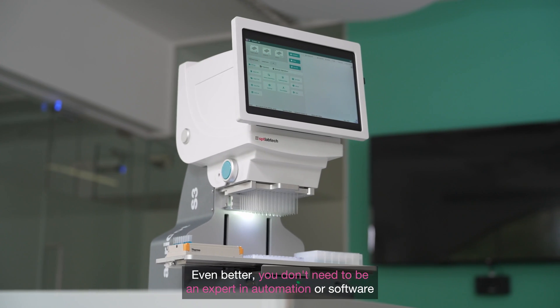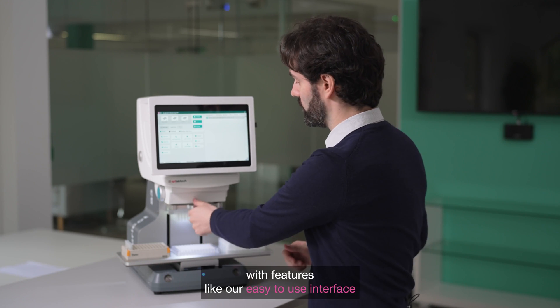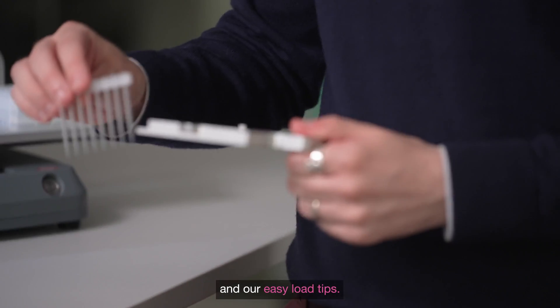Even better, you don't need to be an expert in automation or a software whiz to get the most out of the S3, with features like our easy to use interface and our easy load tips.